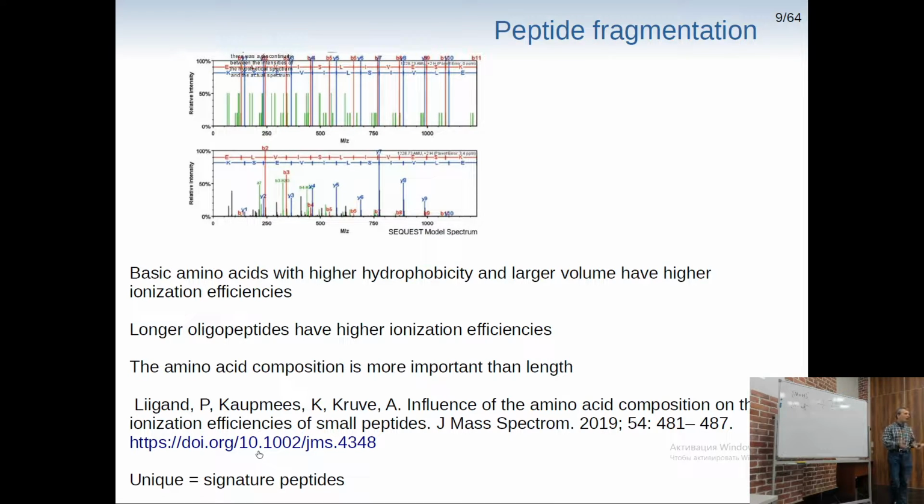So for each single peptide, we'll get more fragments that we can detect, right? So electrospray is better in this case, and also for fragmentation, we'll try to use at least doubly charged ions, because this way we'll get more signal, right?